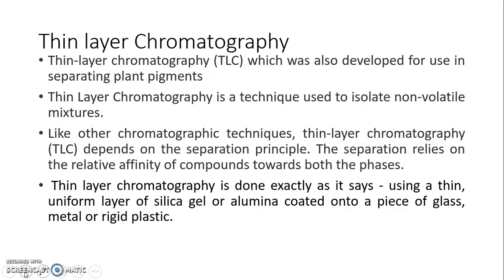Thin layer chromatography was actually developed for the separation of plant pigments. As I said, the chromatographic technique was first introduced to separate plant pigments, and thin layer chromatography was also first used for that. It is more applicable to non-volatile mixtures, that means mixtures which can be retained on a surface.